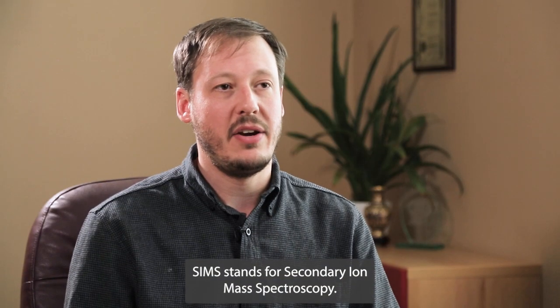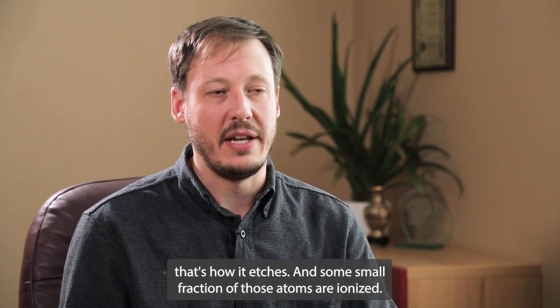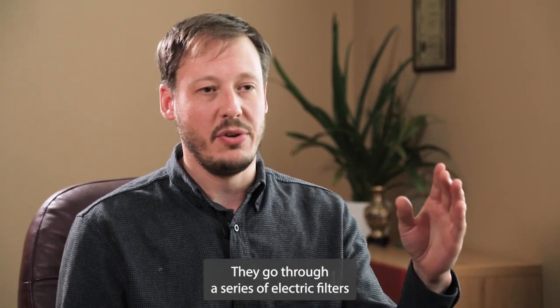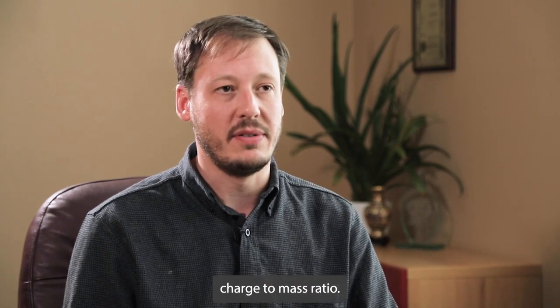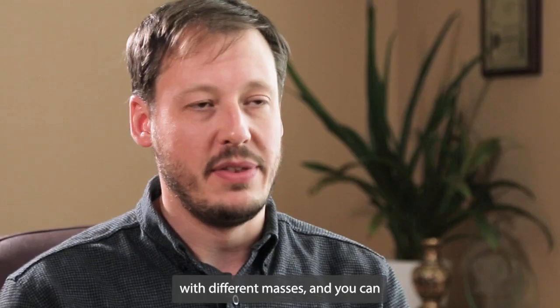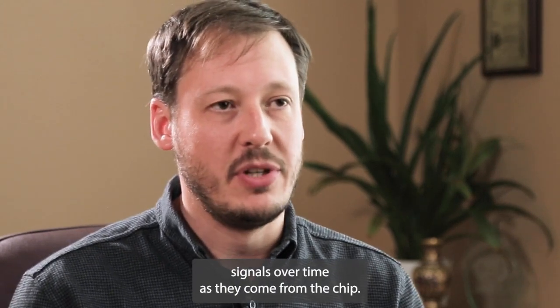SIMS stands for secondary ion mass spectroscopy. So the way that works is when the ion beam hits a substrate, it ejects atoms, that's how it etches, and some small fraction of those atoms are ionized. Those are picked up by the SIMS. They go through a series of electric filters and then the quadrupole filter, which selects them by charge to mass ratio. So for instance, you have copper or tantalum with different masses, and you can monitor those signals over time as they come from the chip.